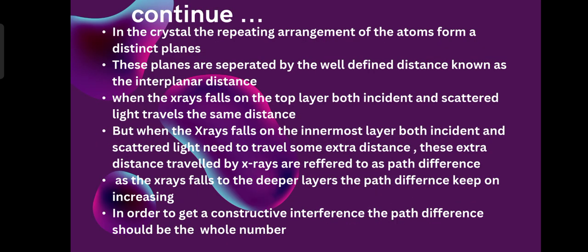Let's continue further. In the crystal, the repeating arrangement of atoms forms distinct planes, and these planes are separated by a well-defined distance known as the interplanar distance. This will be understood well in Bragg's equation. We will discuss further.